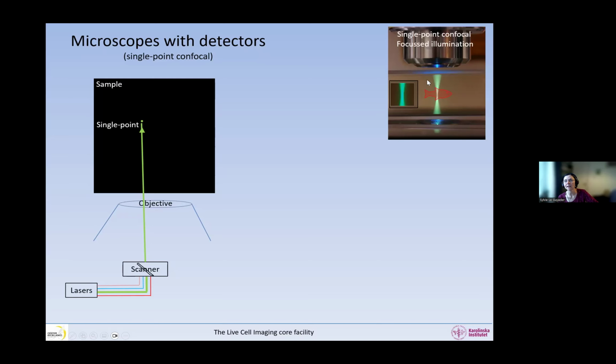And if we look at it again with this very clever way with this chamber filled with fluorescent dye, we can see that the shape of the illumination is very different. Now we have like a double inverted cone. Okay, so we have these cones of light, and it's focused here. This is the highest focus of light. So this is where the light is most concentrated and strongest. But we anyway illuminate above and below.